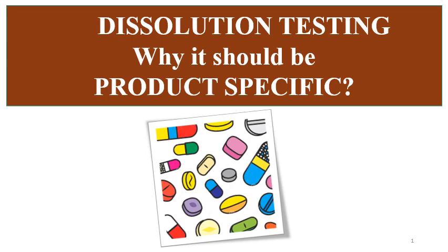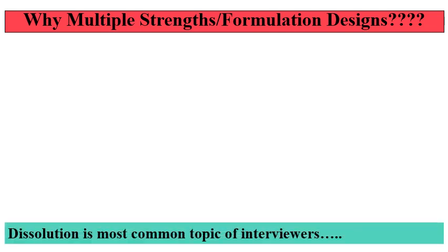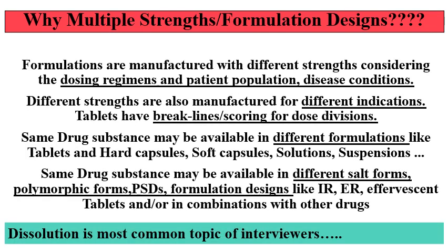The topic is why dissolution testing should be product specific. In simple words, why every product has different and specific dissolution testing conditions. So, first of all, we have to understand why multiple strengths of the formulations are there.